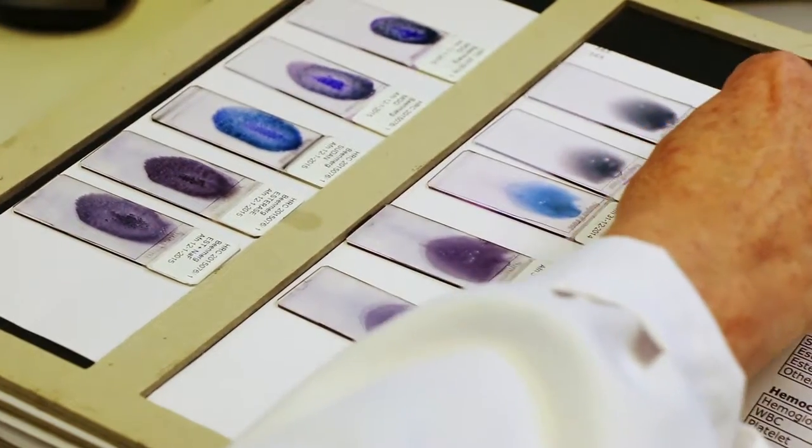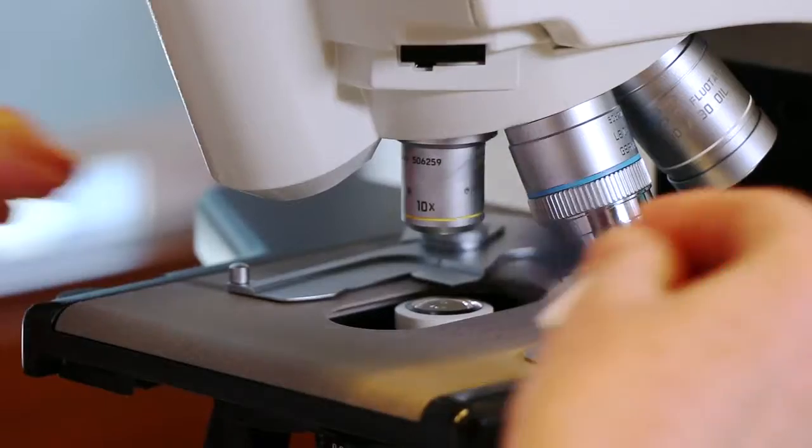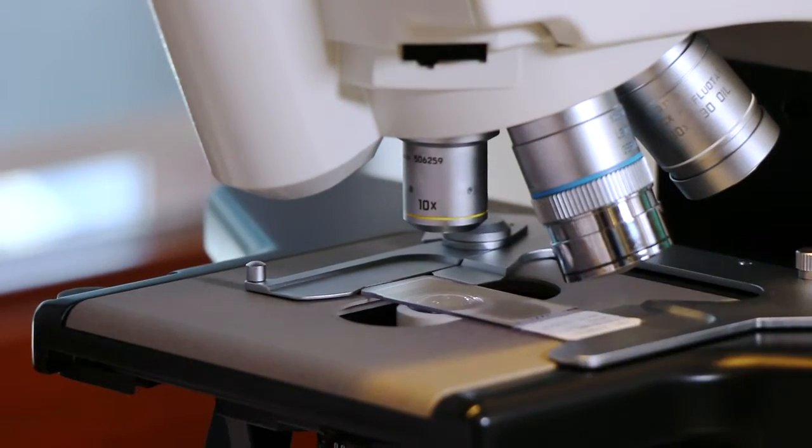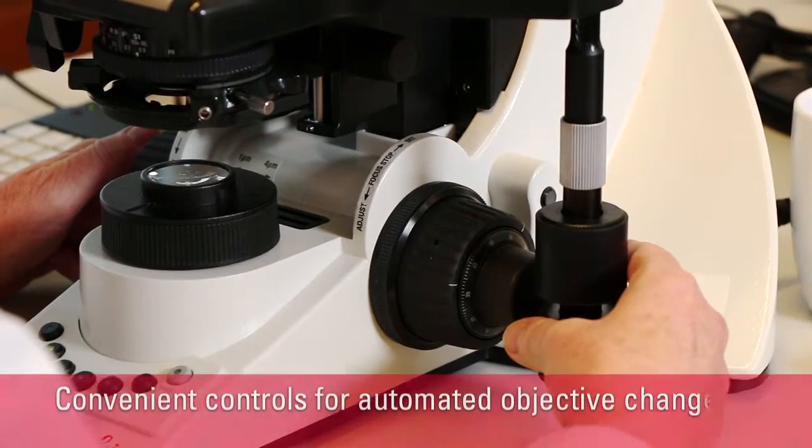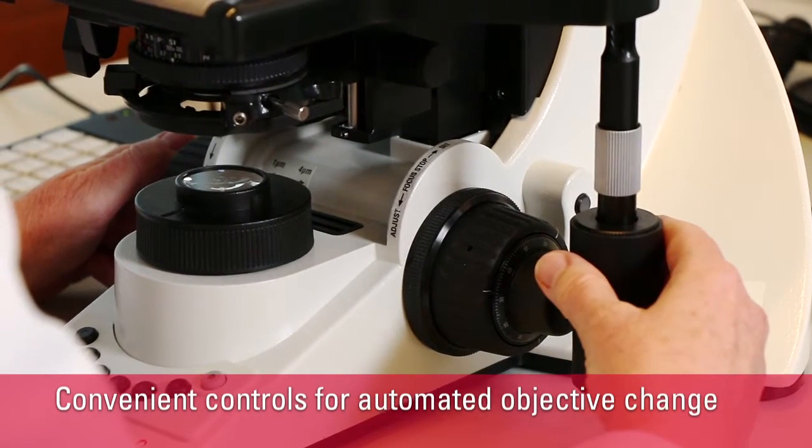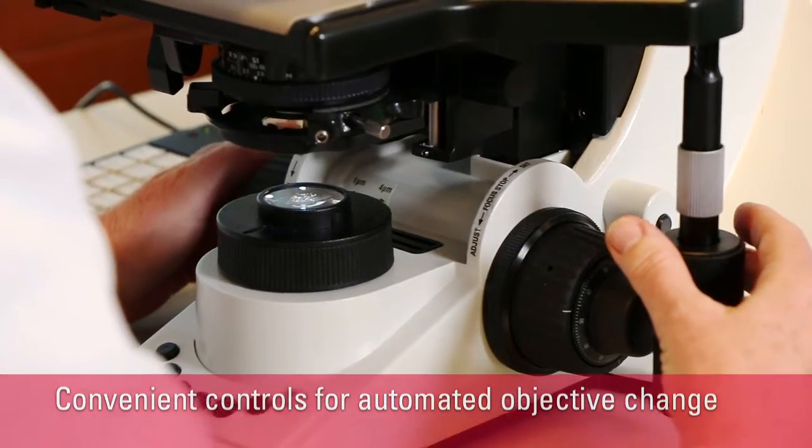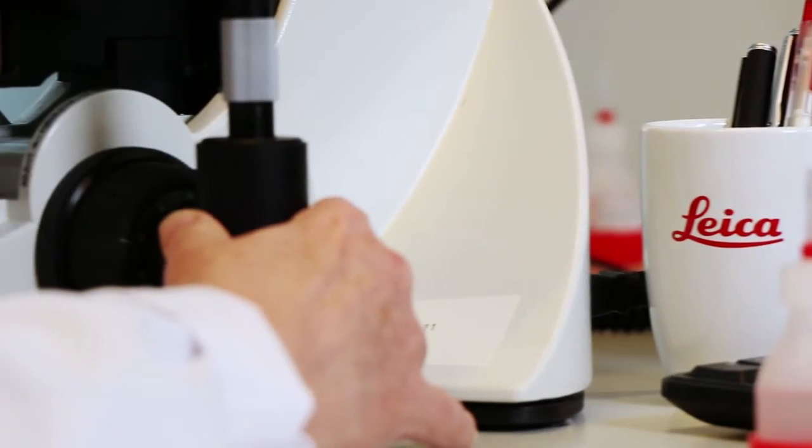I always start with peripheral blood. It's very easy to use these knobs because they're very close by. I can do it on the side and I can do it in front, and I use both because I have to make a report and go from the report and the counting to look through the microscope, and then it's very easy to use both.